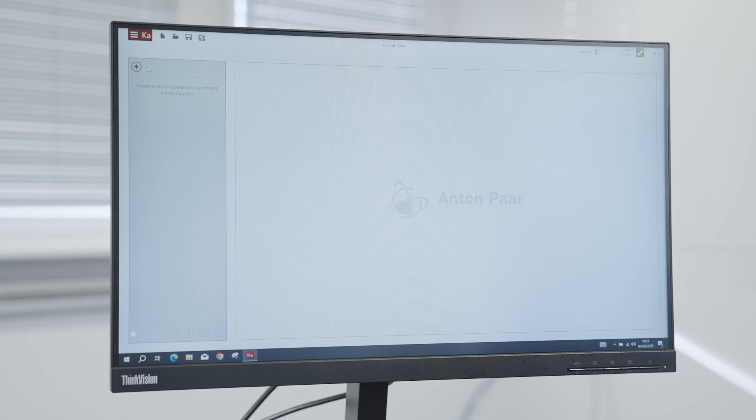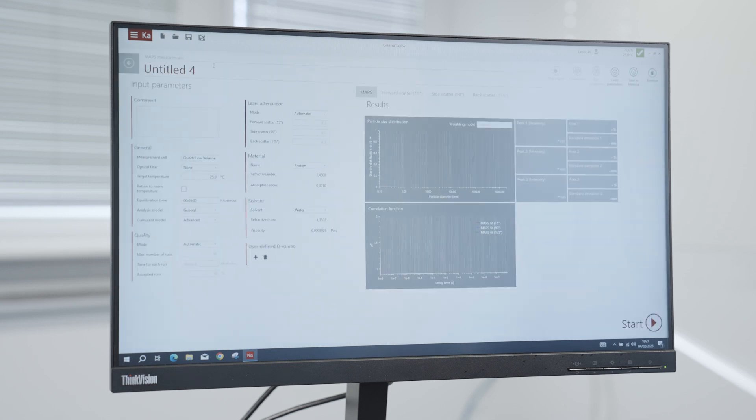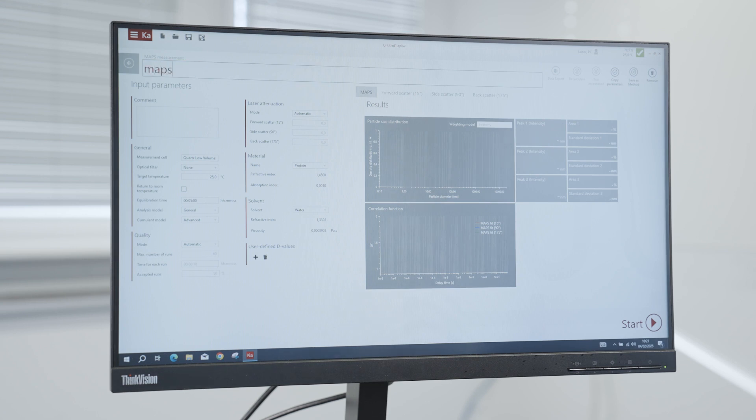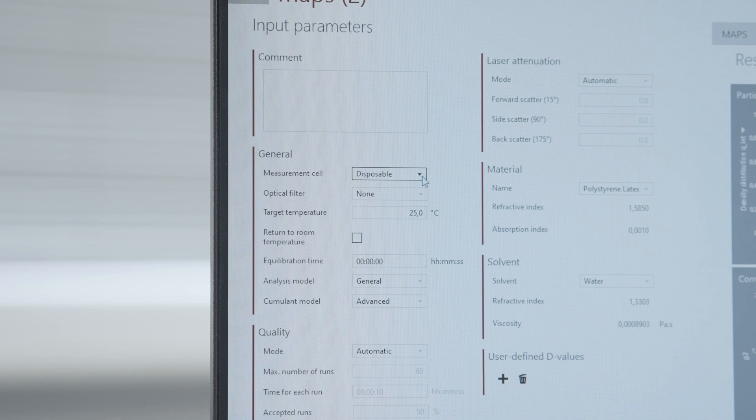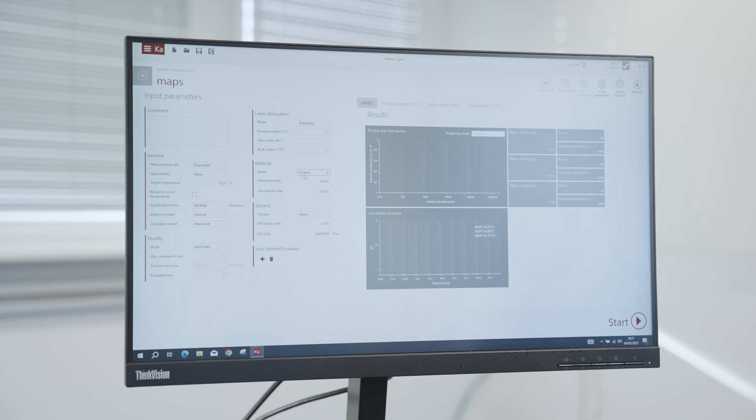A special feature of the DLS 701 is the multi-angle particle sizing measurement mode, short MAPS. All three angles are measured automatically and the data is combined to display one result. Be aware that not every type of cuvette can be used for this measurement mode because all three angles must be accessible. Only the disposable glass, quartz, and quartz low-volume cuvettes are possible. The parameters are otherwise identical to a single angle measurement.